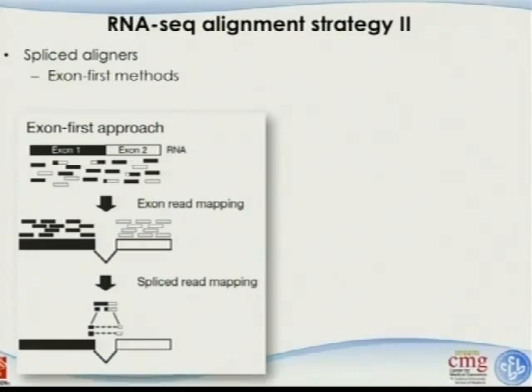And when you detect so many different reads, some black goes to exon 1, and white goes to exon 2. And there's some kind of mixtures, and these are junction reads. So the general approach for this is you'll first just map your reads against the genome. Don't worry about RNA. Okay? So you find some of the reads mapped here, others mapped here, and which is perfect. And none of those hybrid reads will be mapped because they are across junctions.